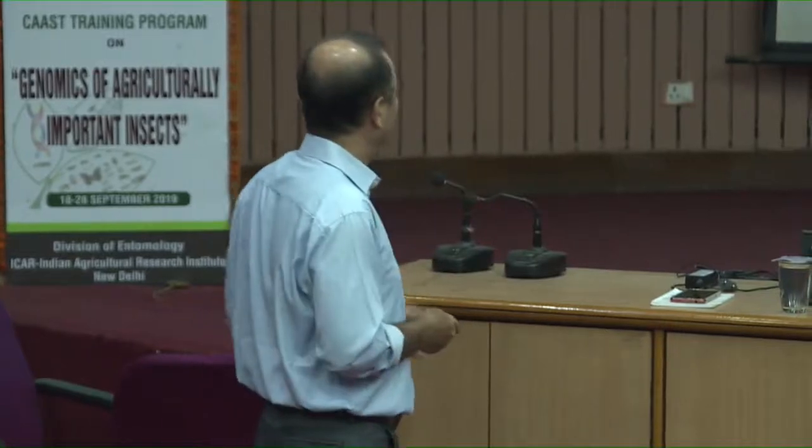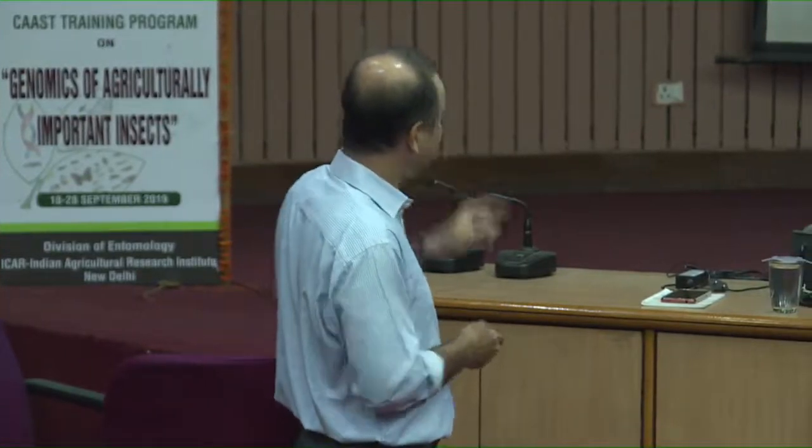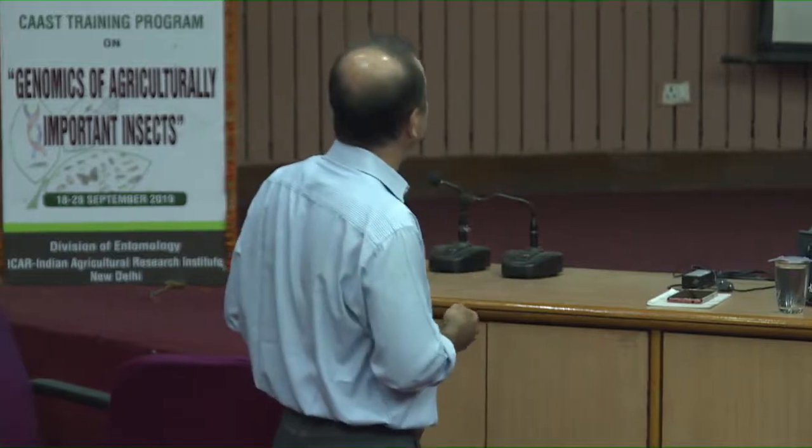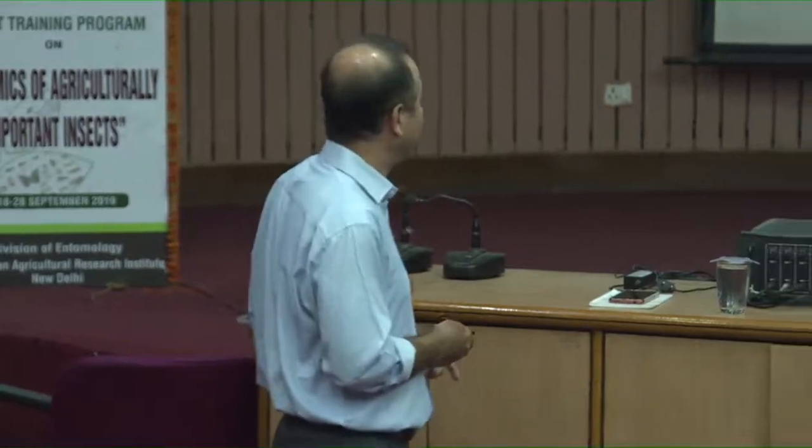So, that is again a major use of RT-PCR, but today we will primarily focus on one of its uses, that is how do you use RT-PCR for gene expression analysis.